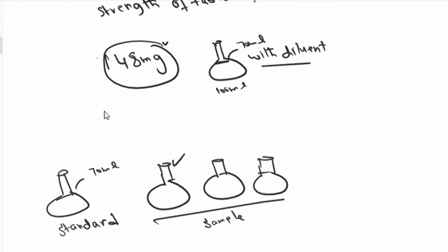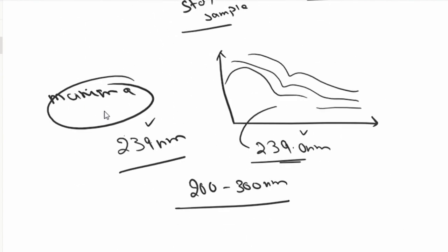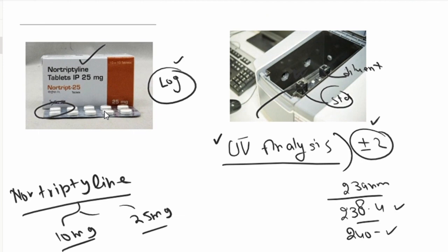Different clients have different setups and conditions to conduct the UV analysis, so you will check accordingly, but those are the general things that need to be followed when doing UV analysis for Nortriptyline tablets. So if you have any questions, you can ask in the comment section.